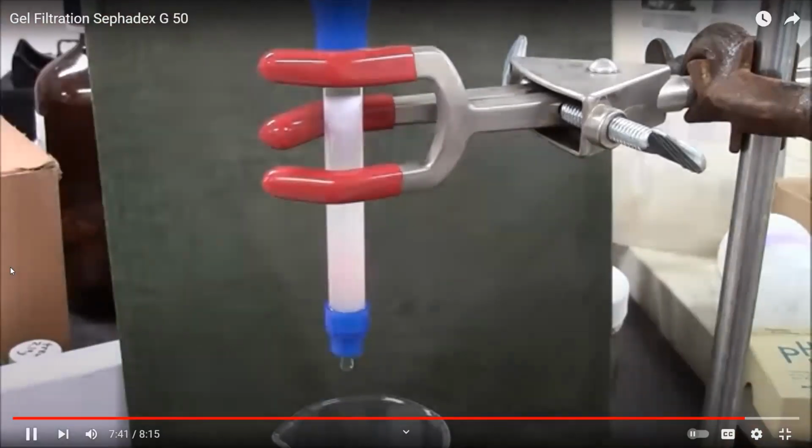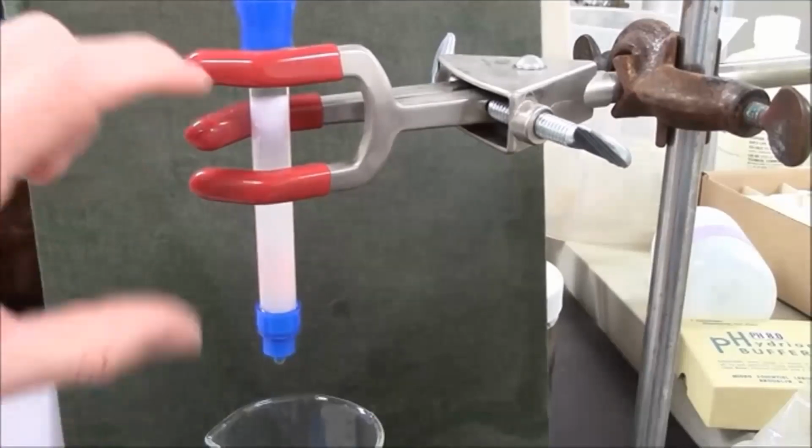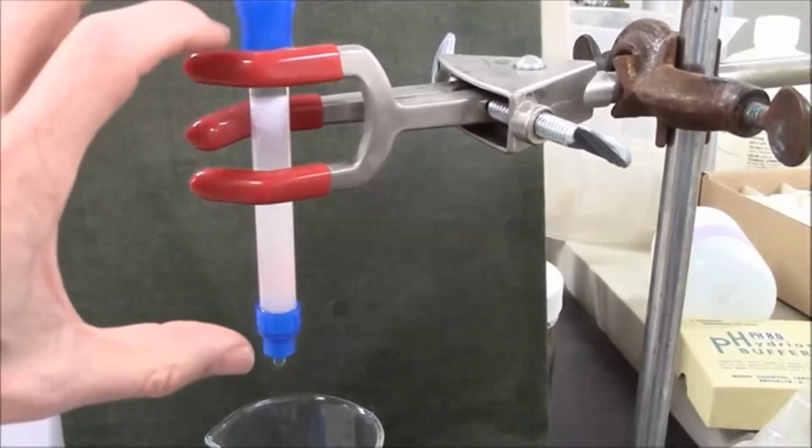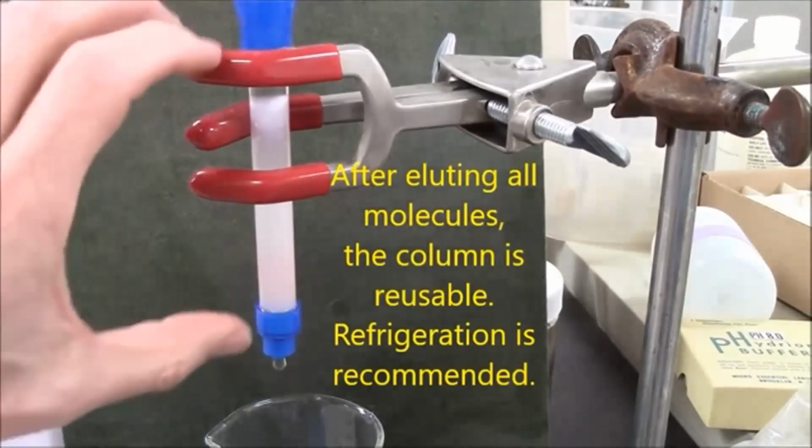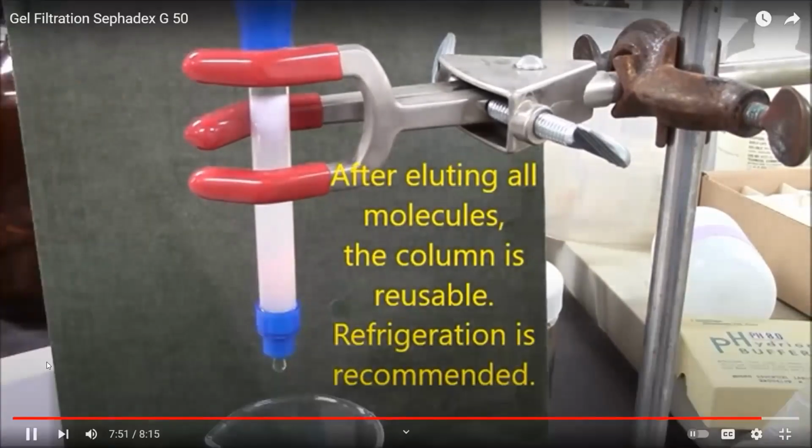From the blue dextran. So the column, if I've done it well, comes out completely colorless. It's reusable. Sometimes microorganisms like to grow in the Sephadex. So if you want to preserve your column for a long period, keep it in the fridge, certainly. And yeah, the matrix is actually dextran, which is a polymer, and microorganisms can grow on that polymer. And that's why, again, never keep the column dry. You can reuse it after you have given thorough washes.